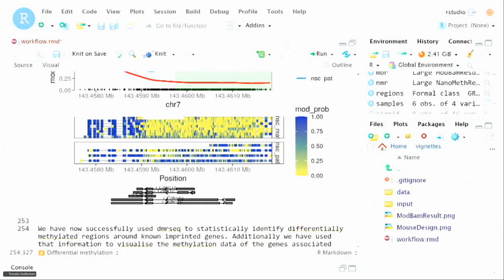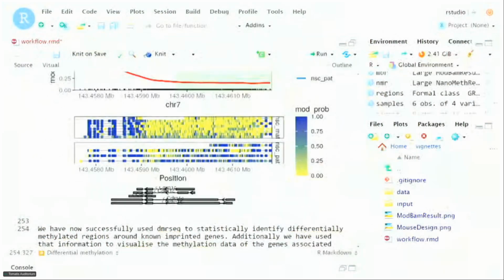And you can see here essentially what the coverage tends to look like. You get dense coverage. So for this particular sample, it's only a 4x coverage in this region, but for that 4x, it's pretty well covered.